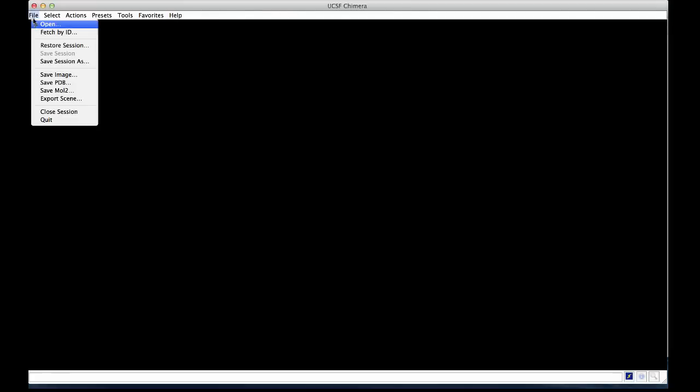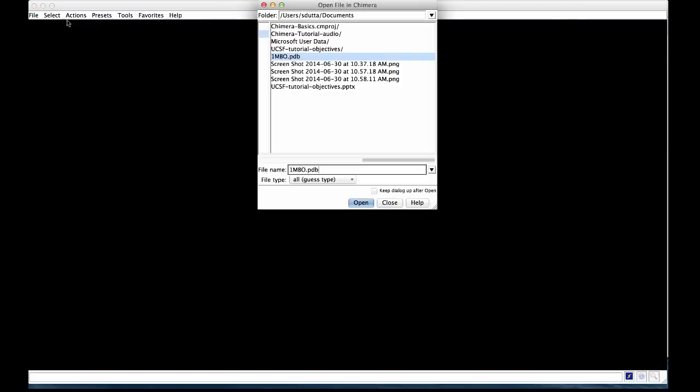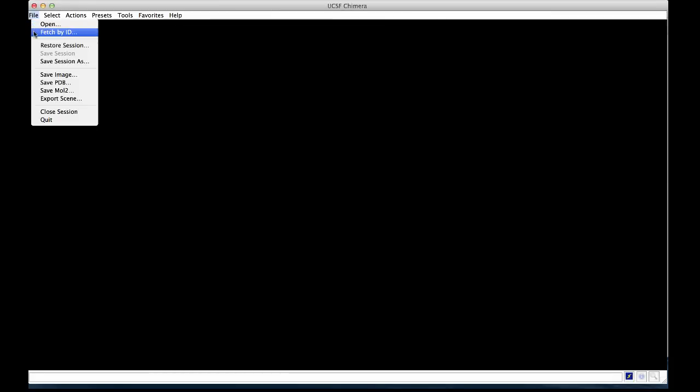To upload a new file, use the file menu. You can either open a file that you have saved on your computer or you can fetch by an identifier. In the latter case, the computer that you're using must be connected to the internet.